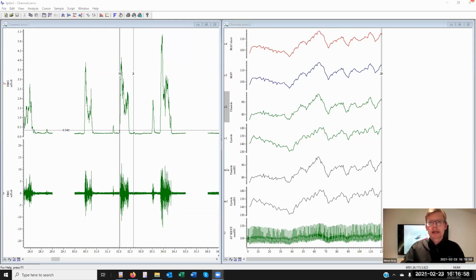as it was on Friday. So if I close each window in turn, so close this window here, I haven't at that point saved a resource file. Okay, the resource file is only saved when the last window of that data file is shut down.